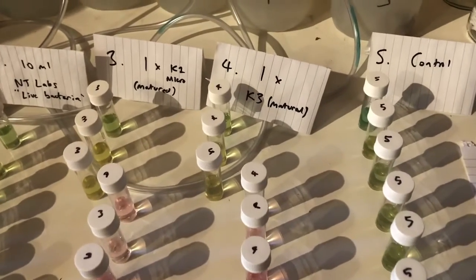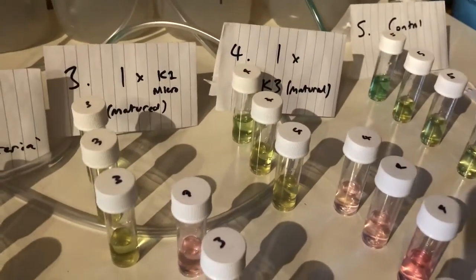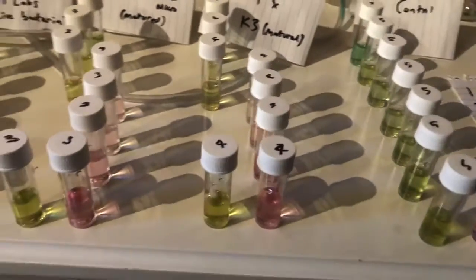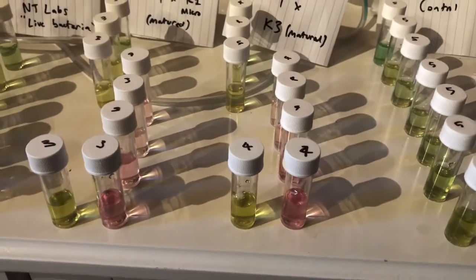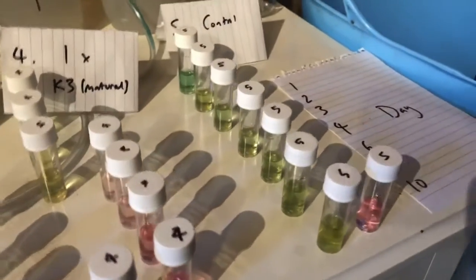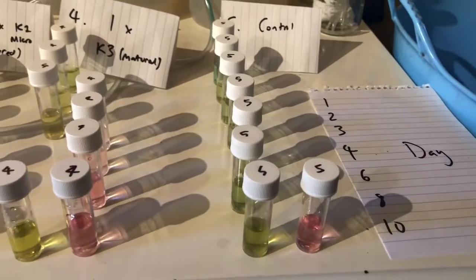On the K3 piece, that again removed most of the ammonia after day 3, so I switched to the nitrite testing and we've seen the nitrite increase a bit. So here at day 10 we've got practically no ammonia but a reasonable amount of nitrite still in there. And then the last one is the control, where the ammonia stayed about the same all the way through but the nitrite has increased.